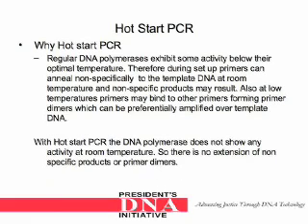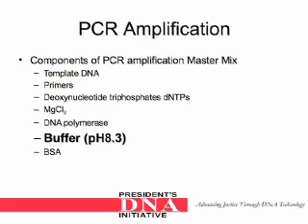Why use hot start PCR? Regular DNA polymerases exhibit some activity below their optimal temperature. Therefore, during setup, primers can anneal nonspecifically to the template DNA at room temperature, and nonspecific products may result. Also, at low temperatures, primers may bind to other primers forming primer dimers, which can be preferentially amplified over template DNA. With hot start PCR, the DNA polymerase does not show any activity at room temperature, so there is no extension of nonspecific products or primer dimers.